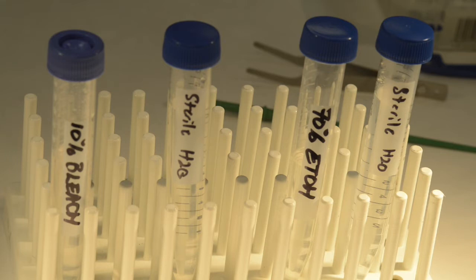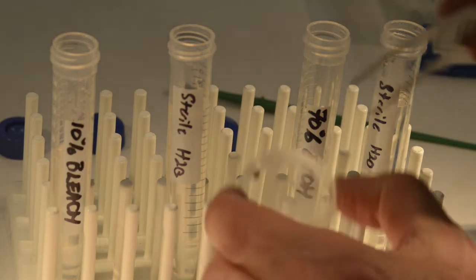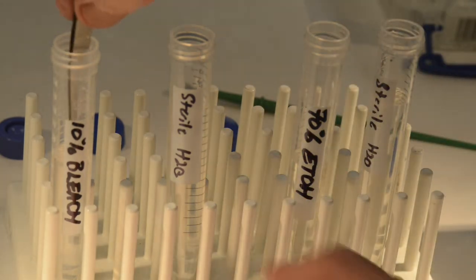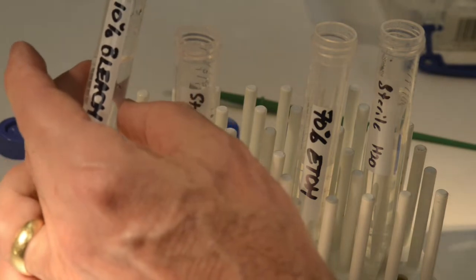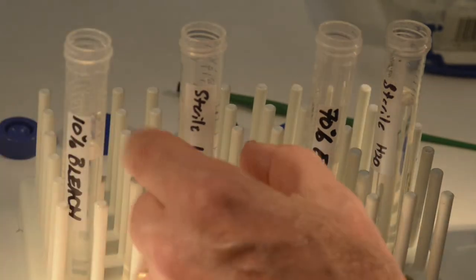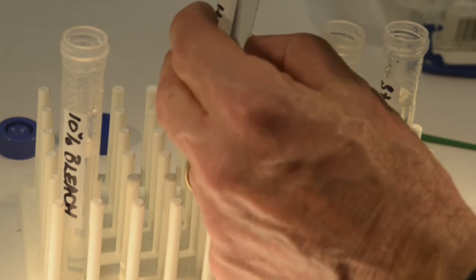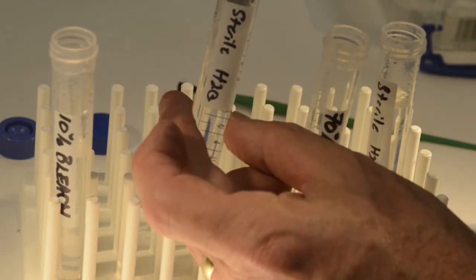Obtain a frozen beetle and use your forceps to hold the beetle firmly, and start by going into the 10% bleach. Once you've gone into the bleach for 3 seconds — you can just count this out loud — then you'll be going into the sterile water for 10 seconds. After the first sterile water, you're going to be putting the beetle into 70% ethanol.